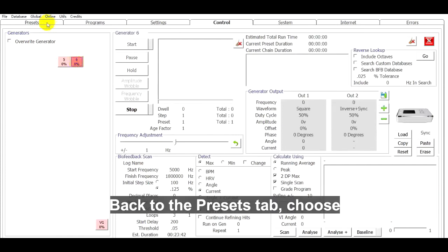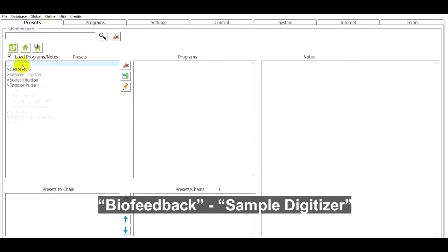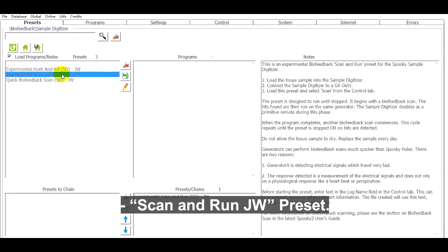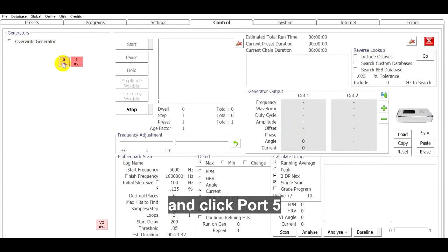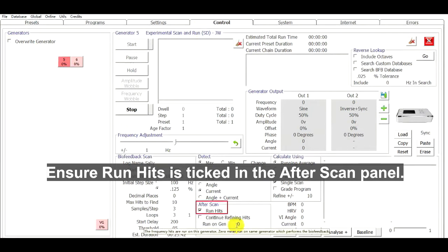Back to the Presets tab, choose Biofeedback - Sample Digitizer - Scan and Run JW preset. Then go to the Control tab, tick Overwrite Generators and click port 5 which is connected to the sample digitizer. Ensure Run Hits is ticked in the After Scan panel.